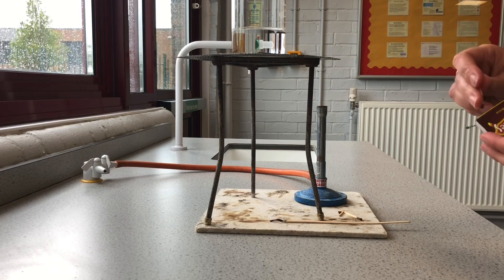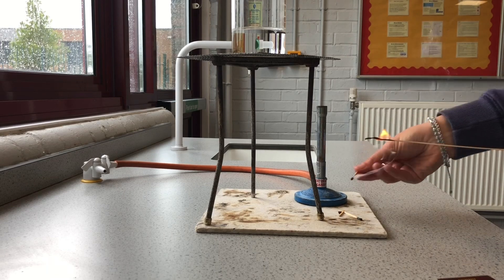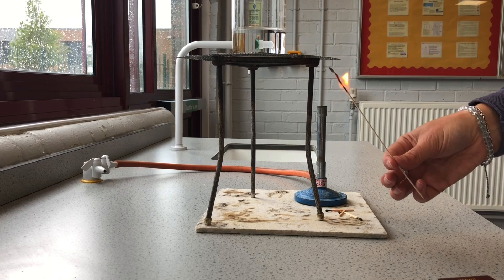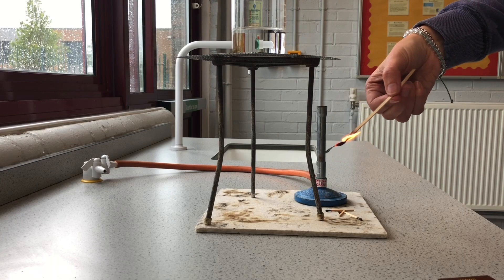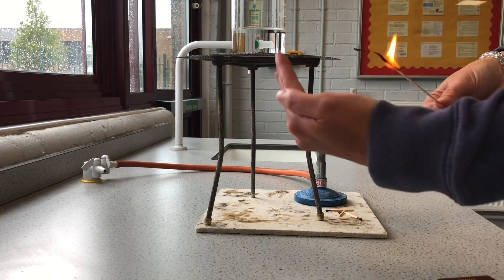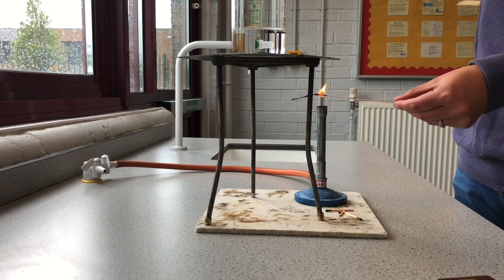So I'll relight the splint. Sometimes if it's burning a lot we can just hold it like this and it will burn slightly less. If it looks like it's going out we can do this and it'll stop burning further up the splint so we can keep it alight. Generally we hold it like this, shield it like this, and bring it over to the Bunsen — holding it above the Bunsen burner.